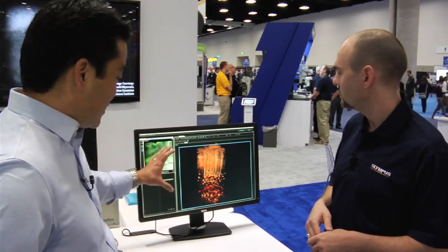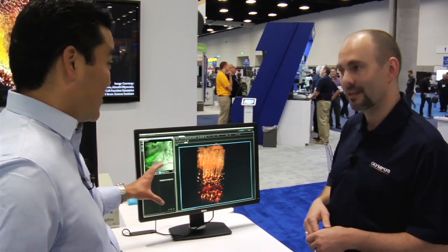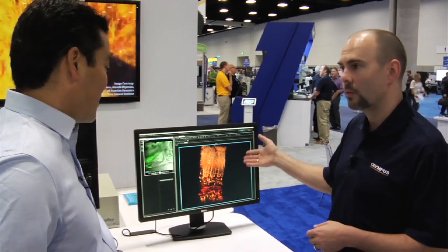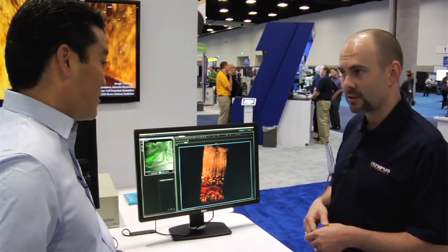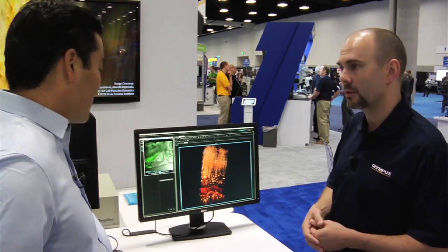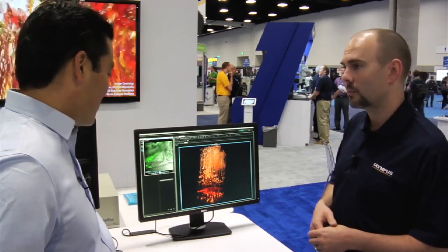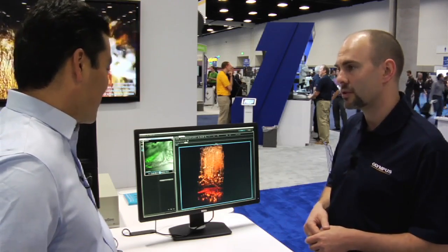That kind of resolution and detail in a living animal. Yes. This is a Thy1 YFP H-line mouse, one of the favorites of the neuroscience community right now. Here we are imaging into it — an anesthetized animal — with very good definition.